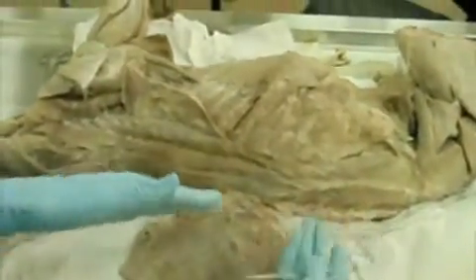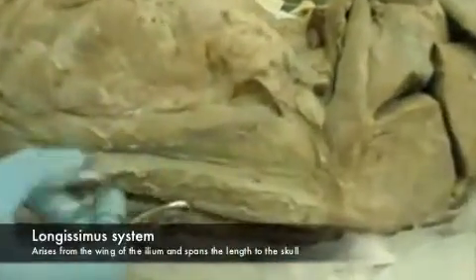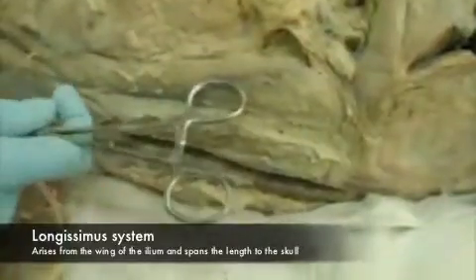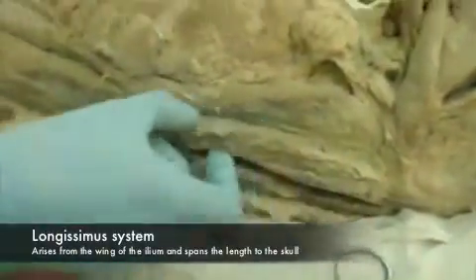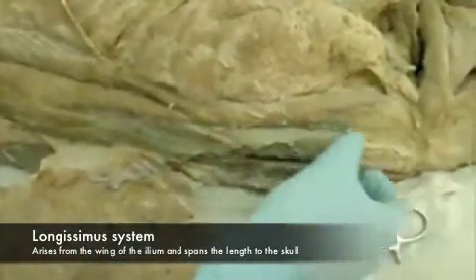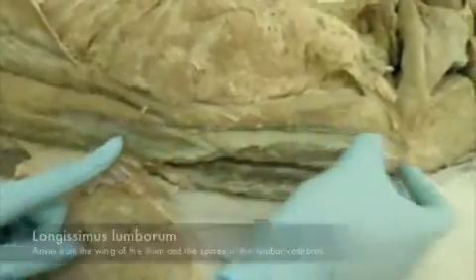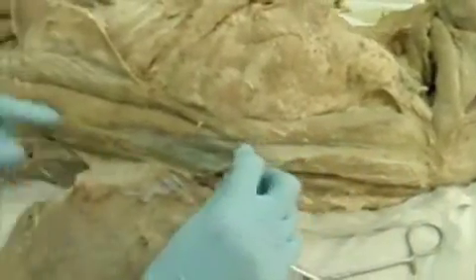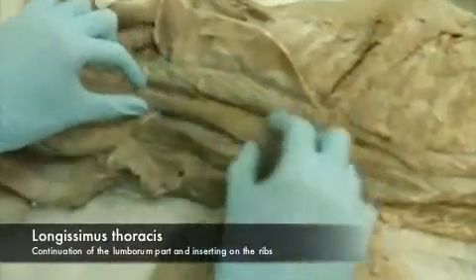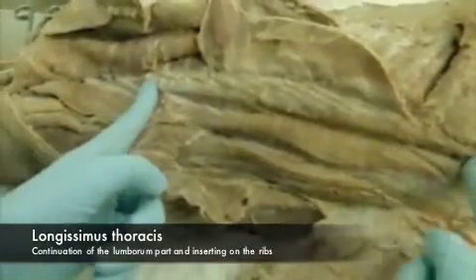Let's move on to the next one, which is sandwiched in between the two, your longissimus system. Okay, sandwiched between your iliocostalis and your transverso spinalis system, your longissimus. So longissimus has a few parts. First of all, it has the longissimus lumborum, which is the lumbar part, and then you move up here, and this is your longissimus thoracis. Okay, the longissimus of the thorax.